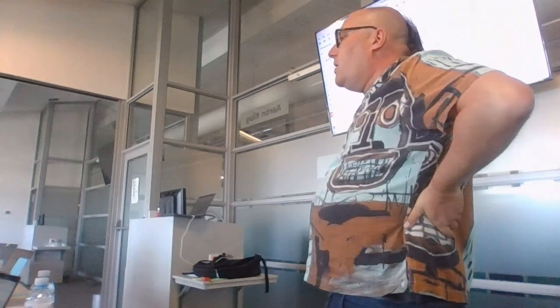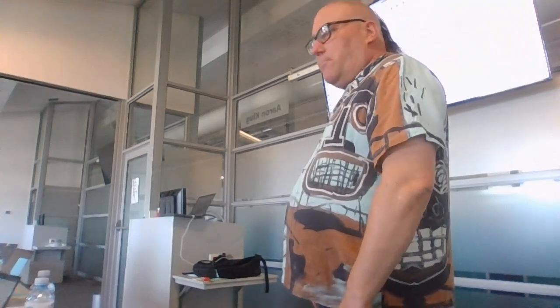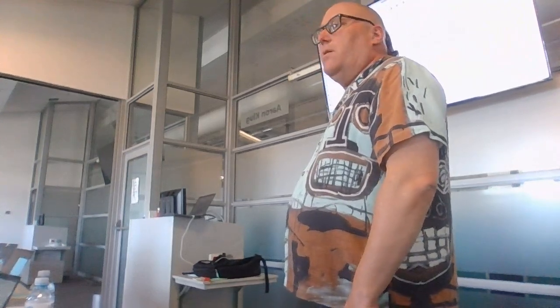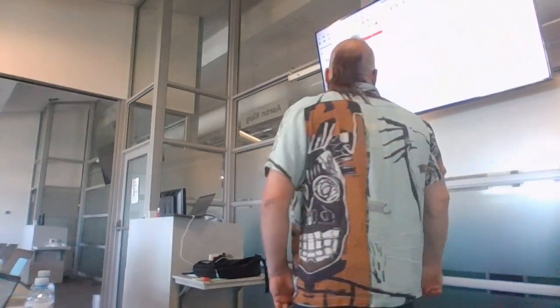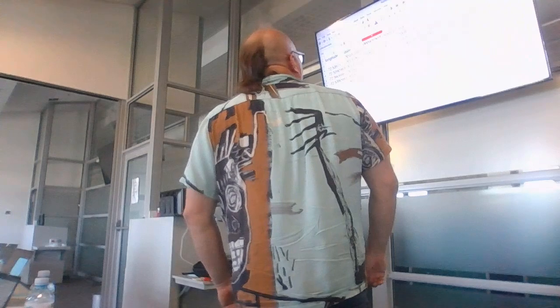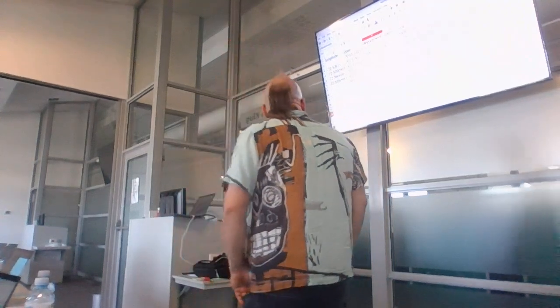Which is the kind of thing that we expect to see with organisms when they're under selective pressure in the environment. We expect to see some mutation that happens by whatever chance become then fixed in the environment. But yeah, sorry, I don't know why MicroReact doesn't like my file. I'll figure that out overnight.